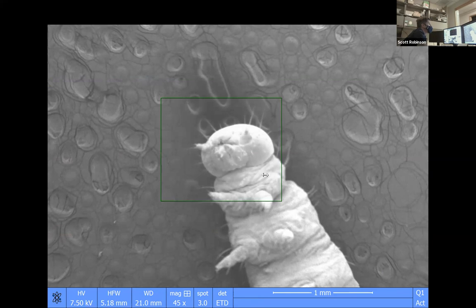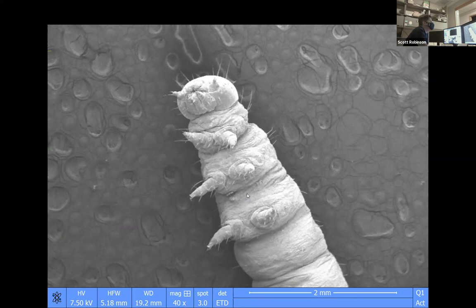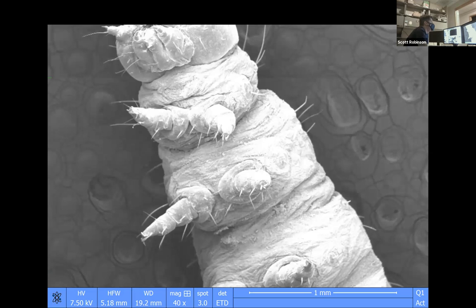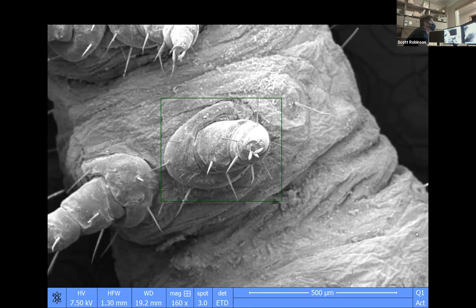The caterpillar of some kind? Yeah, so you can see it has three sets of legs on the top part of its body, and then there's another set of legs further down. I think we're not supposed to call them legs when they go on beyond. If it's an insect, they're sort of like fake legs. Yeah, I think they're called prolegs. Yeah, professional legs.